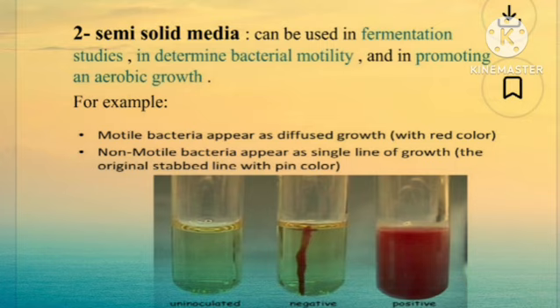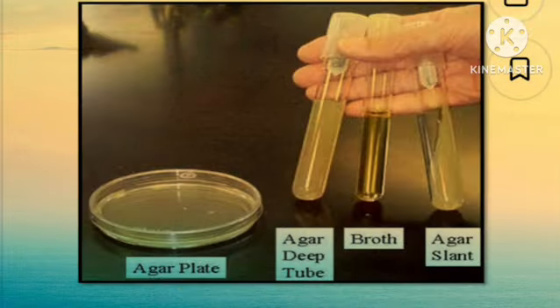This is semi-solid media. It is primarily used to test cell motility, and it can be used for fermentation studies.